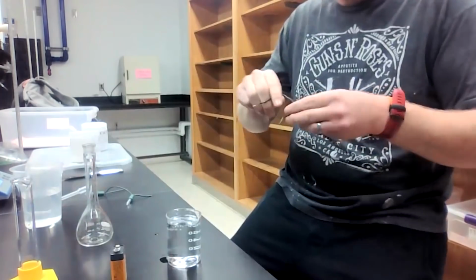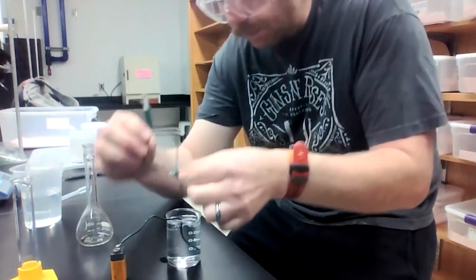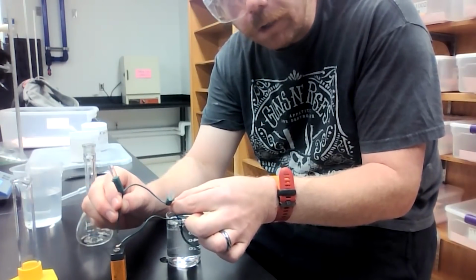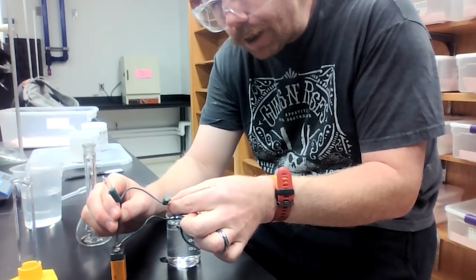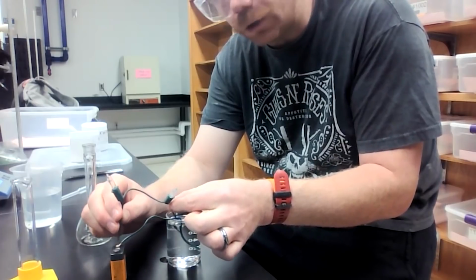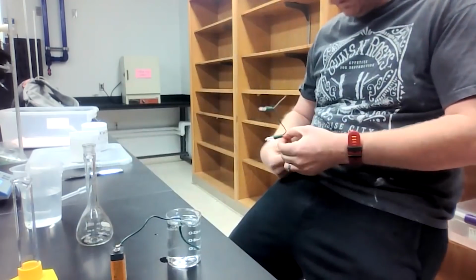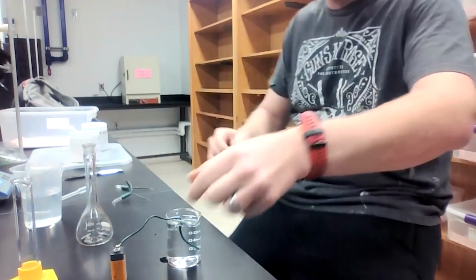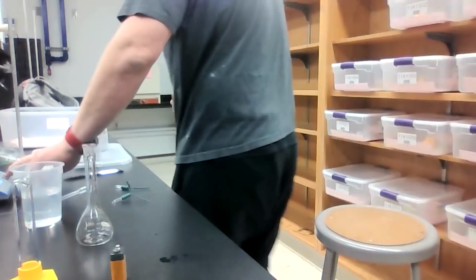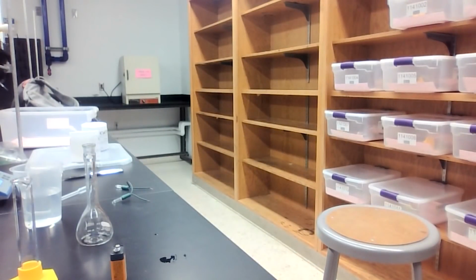Is this ion concentration high enough to get these lights to light up? Is my question. Oh, you can't tell there. Or maybe you can. Yeah, you can tell. But as my ion concentration went down, the lights got much more dim. Okay, that's a great thing to recognize. As my soluble ion content went down, so too did the ability for my lights to light up.